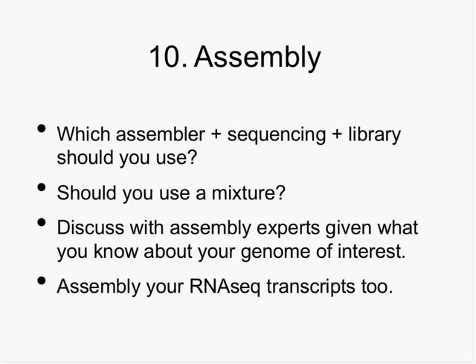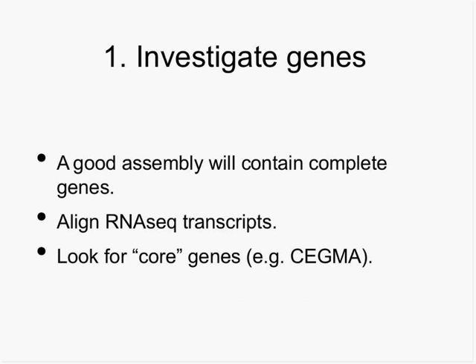Again, we discuss this with our assembly experts, and given some knowledge of our own genome of interest. Every genome is unique, so you have to consider the properties of your genome. How big are your repeats? How much segmental duplication? How much heterozygosity? All of those things go into this very complex equation. And I just want to say one more time, don't think you can solve it yourself. Don't forget to assemble your RNA-seq transcripts, because everybody's going to be doing that as well, I'm sure. So what do we do after this magical assembly process?